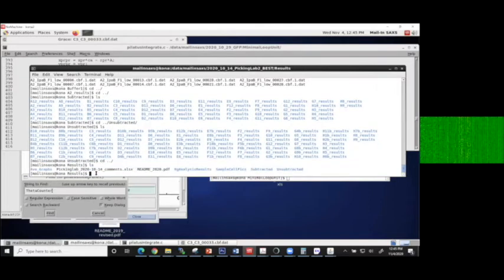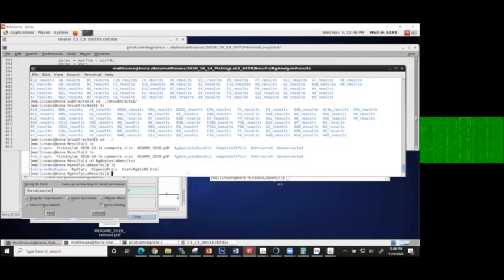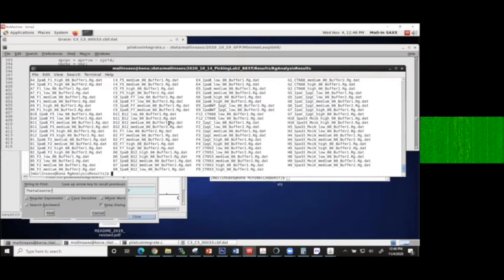Catherine's also put in an Excel spreadsheet that has some comments there. And there's also an analysis of the Guinier region here, which I may not show, but there's some neat things in there. I'll briefly show you. I just looked in that Rg file. Basically, it's pulled out the Rg region for every curve. And sometimes it would be like figure 1 for a SAXS data set. Okay, so you have that data there.